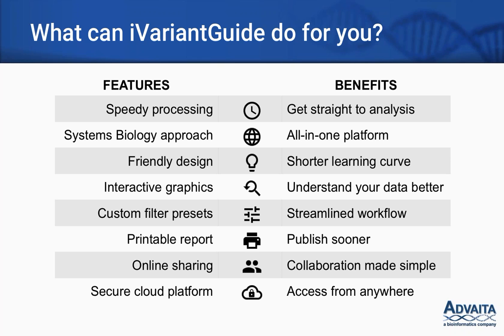We also have online sharing, which means you can collaborate with anyone, anywhere, anytime. Our secure cloud-based platform means you can view your data at your own convenience, wherever you are in the world. We also offer custom filter presets, which can be used across data sets. This saves you time and also makes your analyses automatically reproducible.